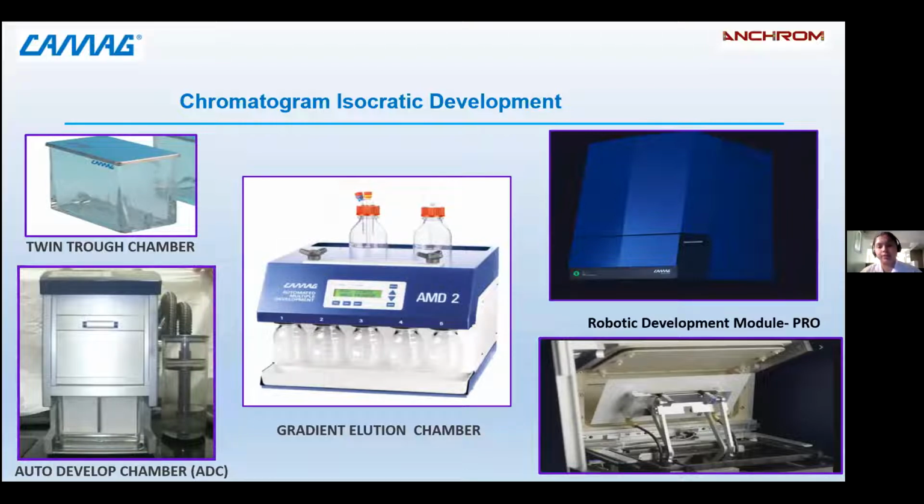Then we have the robotic development pro module, which is very similar to the ADC2, but here development happens very fast. So the chamber is designed such that the development happens through the gas phase only, and every time you don't have to put in a mobile phase. So the mobile phase is circulated into that chamber, and the gas phase is also circulated in that chamber. So this is the development module pro.